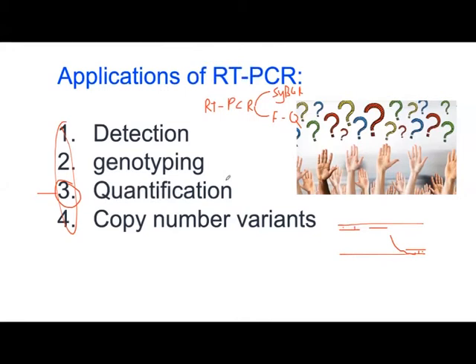You can sometimes, but you need to make sure of the data. Now, if you want to ask about sequencing, remember sequencing is a different technique. We use what's called Sanger sequencing or next generation sequencing. They are totally different techniques used to sequence. Here we are not sequencing, we are detecting, genotyping and quantifying, and most people want to study quantification of the PCR.